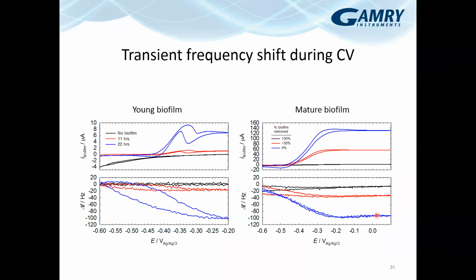There is that OWLS measurement that, I don't know if I should talk about this, Chris, but basically optical methods are a good way to couple to EQCM. It's just a matter of spending the money to do it, I would say.